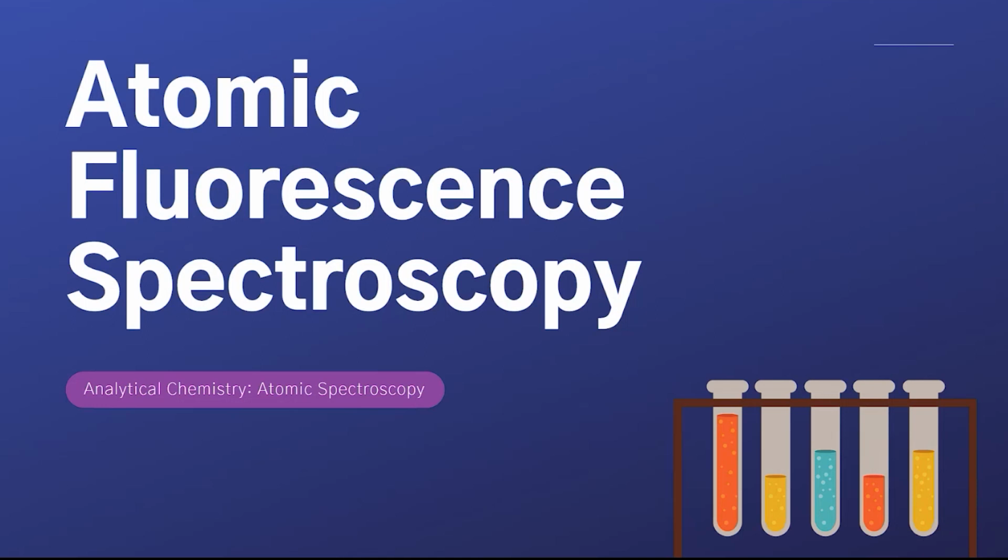Hello, everyone. Welcome back to the video lecture series on atomic spectroscopy. In this final installment, we will be discussing the theories, key concepts, as well as the applications for atomic fluorescence spectroscopy.